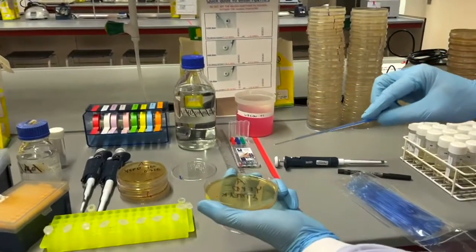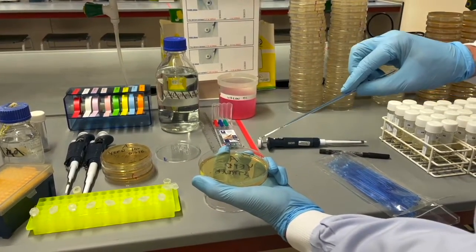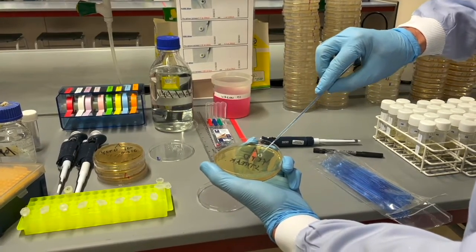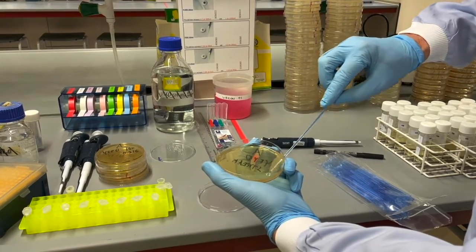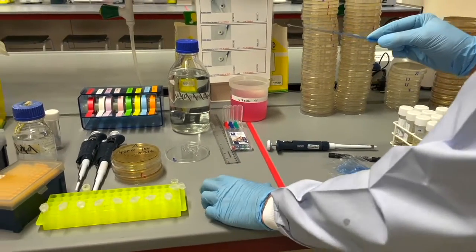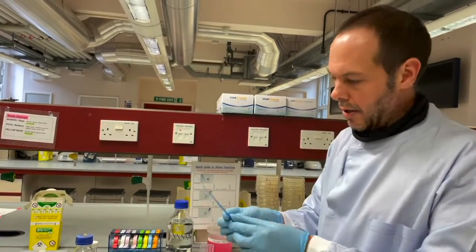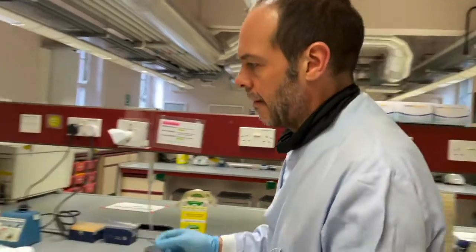Right, now I'm going to pick up cells from the end of that streak and then re-streak them into the next quarter. So I'll start there, pick up a few like that, and then move away. Again, they're going to dilute those cells down, so there'll be fewer at the end than there were at the beginning. Now the loop does leave an impression on the surface of the plate, so you can see where you've been, which is really helpful.